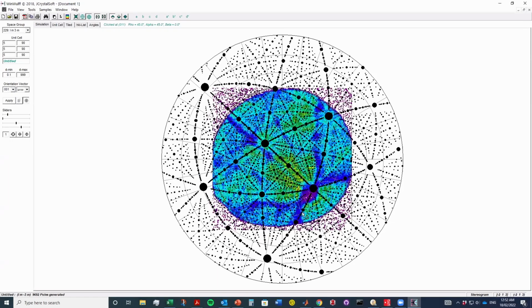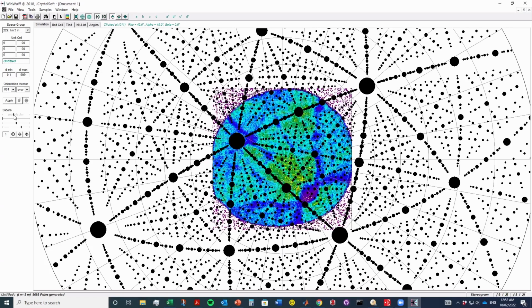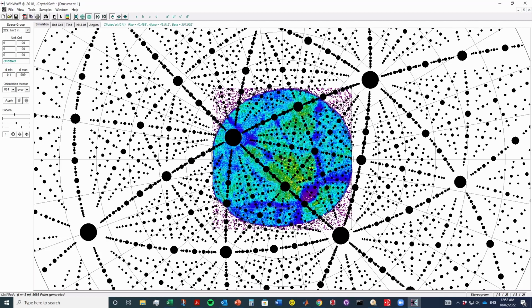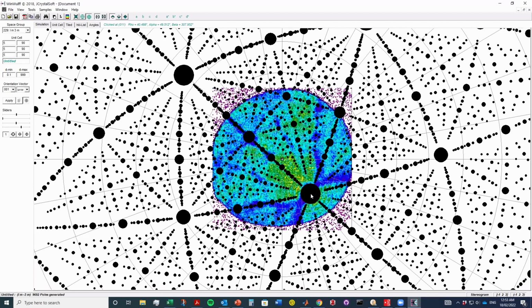And I'm going to center that on that. I'm going to zoom in first to our field of view, which I know is really small actually. Again, old data, I think I overfilled the detector. It's usually a bit larger than this, but anyway. Gonna put that there. It's actually even a little bit further in, I think, something like that. About 50 degrees field of view for this one, which is pretty low.